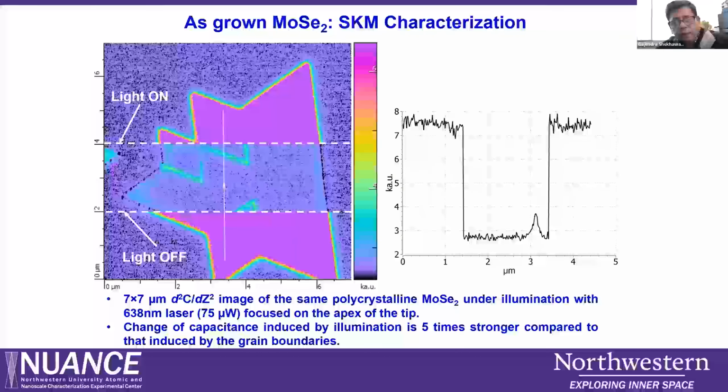And then we also have a dark lift option on this system. Usually, as I said in the beginning, we use the IR laser, the 1300 nanometer, to put the AFM in feedback. In any typical AFM microscopy, you need a laser to maintain a feedback system so the probe doesn't crash on the sample. The feedback can be either on the force or the amplitude.